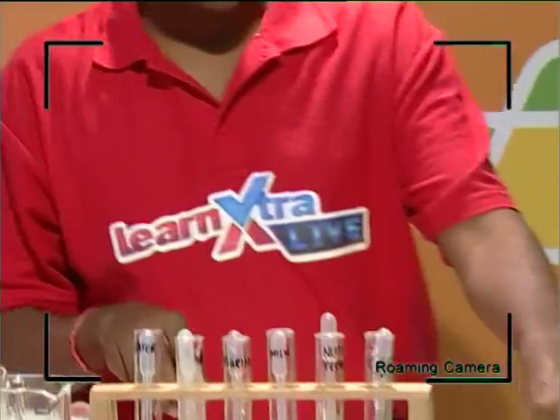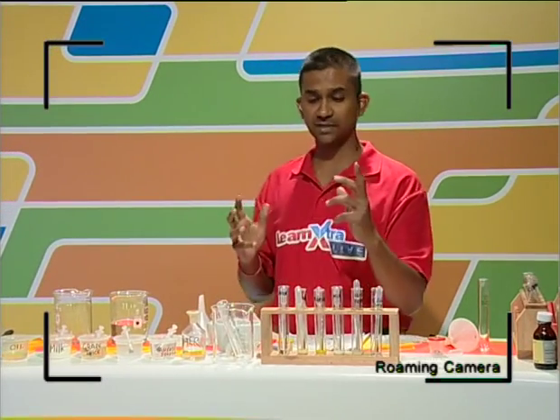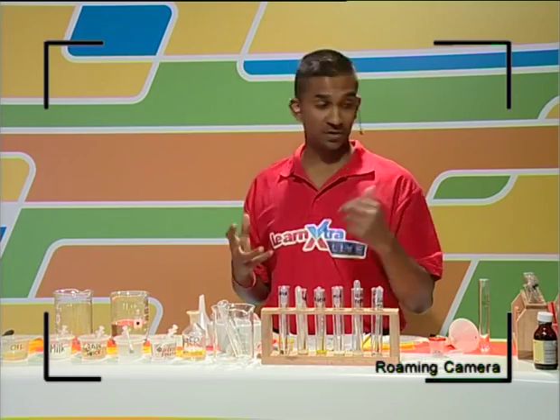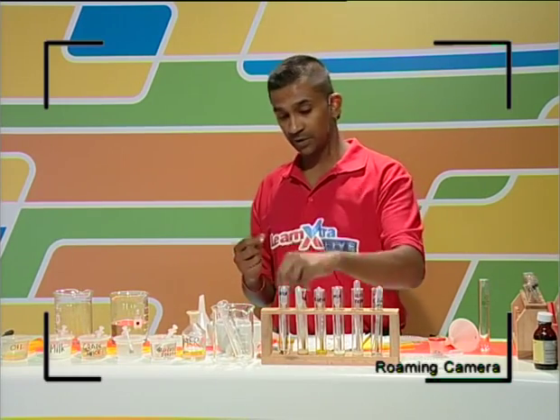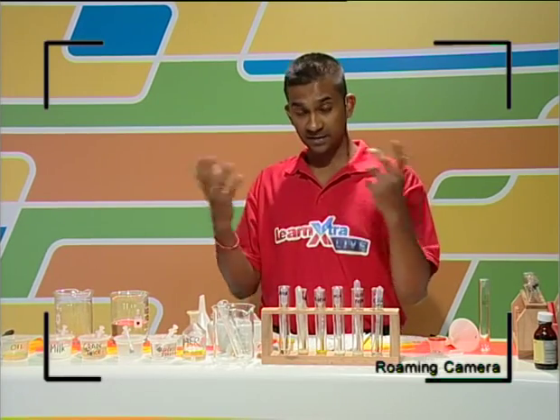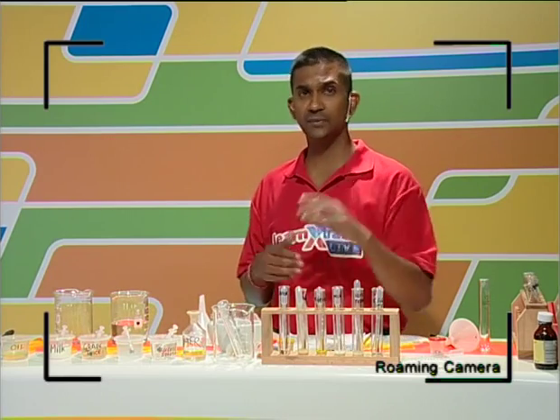So what I've done now is I'm going to place these in front, and I'm going to take a drop from each one of these, using a dropper, and put a slight drop into them. And what's going to happen is, because ether is volatile, we're going to pick up some of the lipids, drop that onto the filter paper and hope that the ether evaporates, and we've got a good breeze in the studio. We hope that will evaporate quickly and we'll get results.